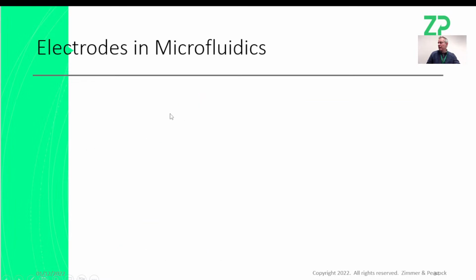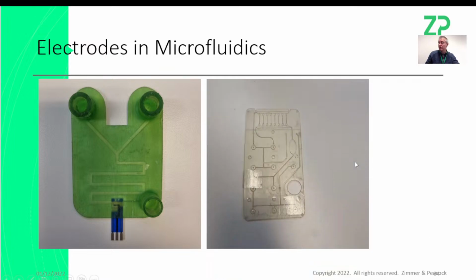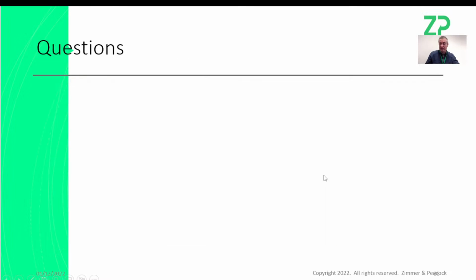I had a feeling that these electrodes might be going to a microfluidic flow cell, so I just wanted to show you something. It's just happenstance that I'm in Norway this week. I was talking to one of the engineers, and I saw this on his desk: he's taken one of our electrode systems and 3D printed a flow cell. It made me think that not only could we potentially do the electrodes, but we could probably put the flow cell over the top of it as well.